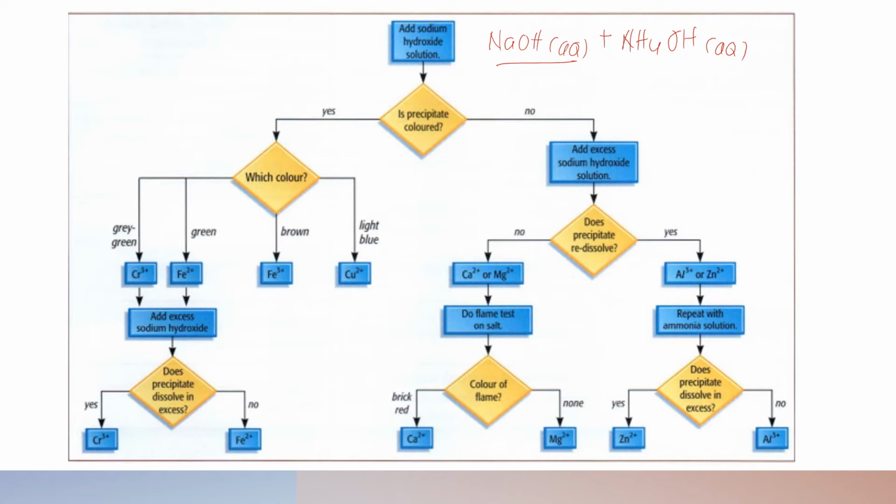If a precipitate forms, then check the color. If the precipitate is colored, then we should observe further. What is the color?